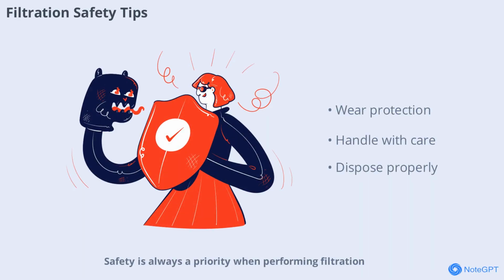Safety is always a priority when performing filtration. Always wear appropriate protective equipment such as gloves and goggles. Handle chemicals and glassware with care and be mindful of hot liquids or sharp edges. Proper disposal of filtered materials is also important to prevent contamination or accidents.